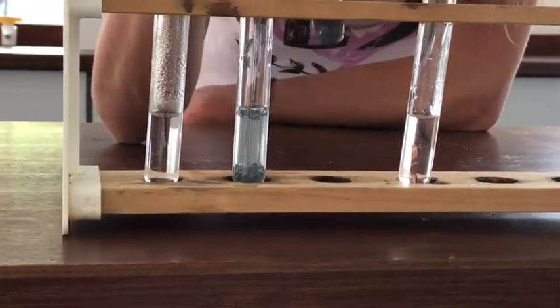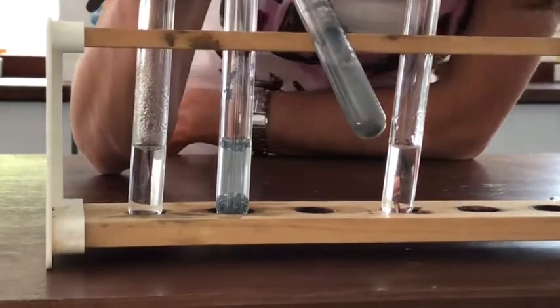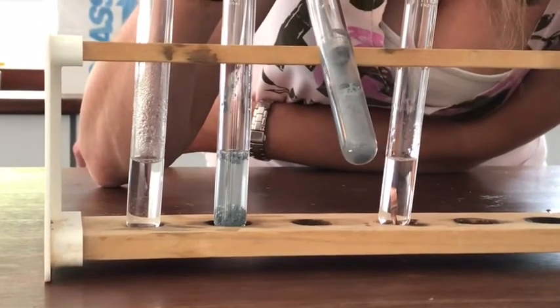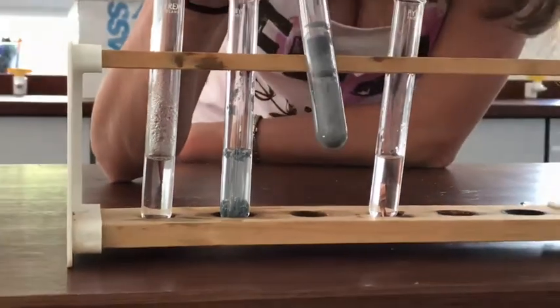So we should be able to make a deduction about the gas that we can see forming. This one has got iron mixed in with it, and this one also — you can see fizzing in the tube. So we should be able to make a deduction there also about the gas that's forming.